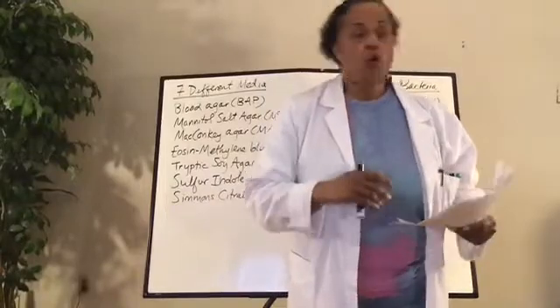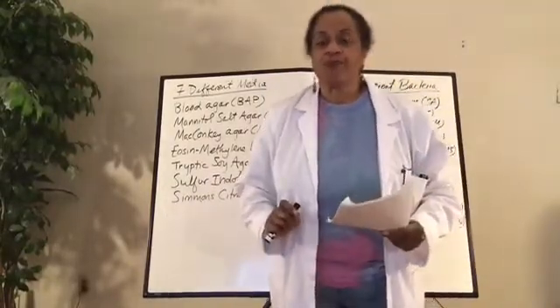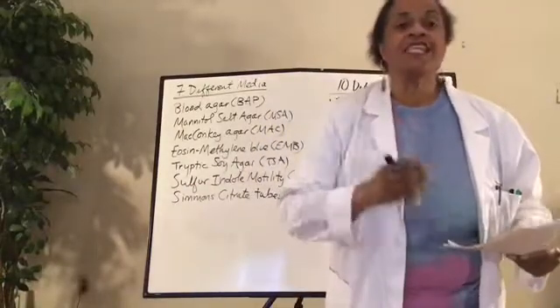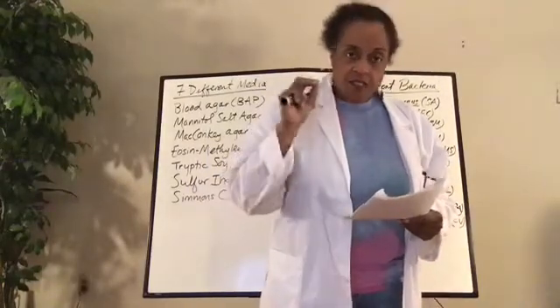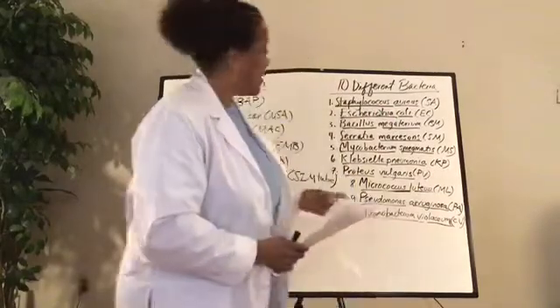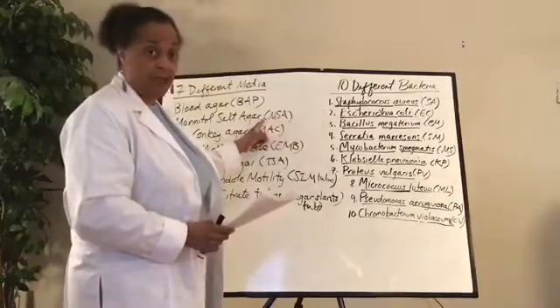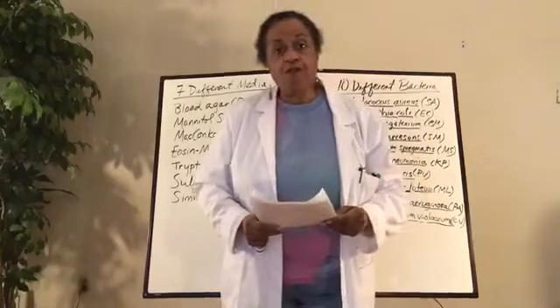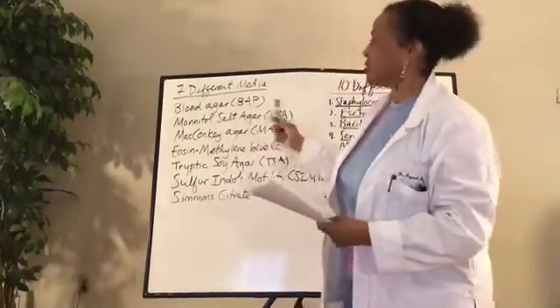This bacteria turns red. This bacteria turns metallic green. That's a difference. You can look at that bacteria and tell the difference. Staph aureus grows on MSA. It ferments mannitol, hence the name mannitol salt agar.